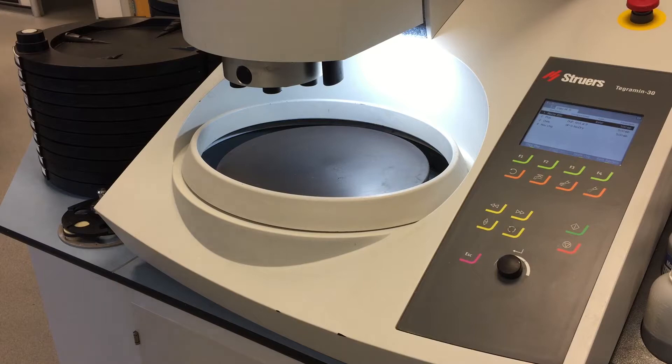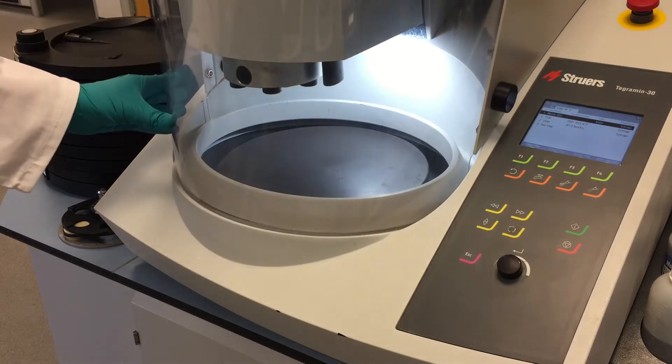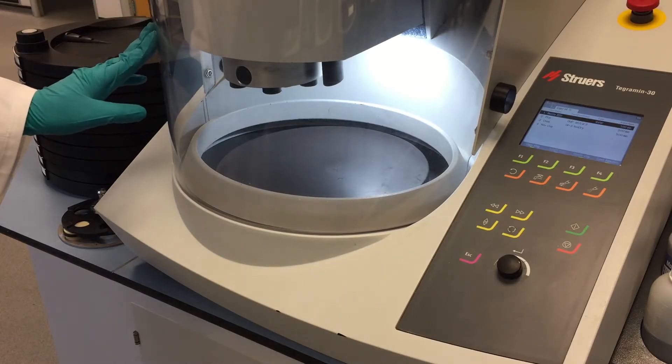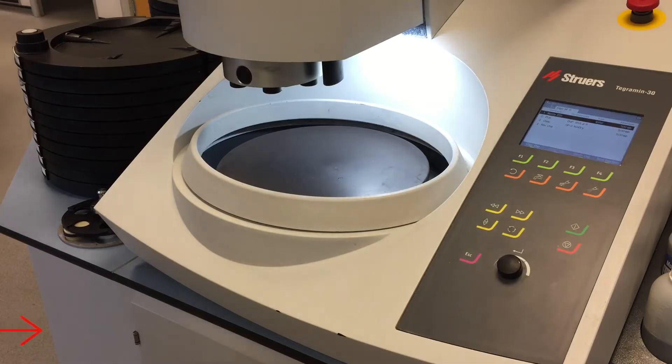The first thing that stands out is the hood on this machine. This is used for a couple of reasons: it improves safety for the operator, reduces noise, and if you have an extractor attached it will pull the fumes out into your extractor system. The machine itself is made from cast aluminium, which gives it strength. The body is a composite — tough as steel but a lot lighter, and unlike steel it doesn't rust.